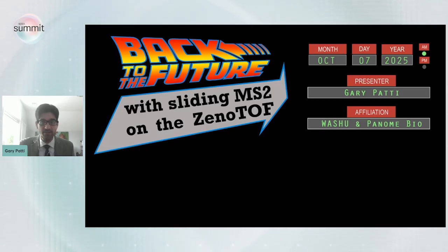What I'm going to be talking about today is introducing the new sliding MS2 on the SCIEX 8600 ZenoTOF system, and the way in which we're taking advantage of this. And the inspiration for the title here, Back to the Future, you'll see in a little while, but it goes back to some experiments that we had originally proposed really over a decade ago, but were never able to do until the launch of this instrument. So we're very excited now to be doing some of these experiments for the first time.